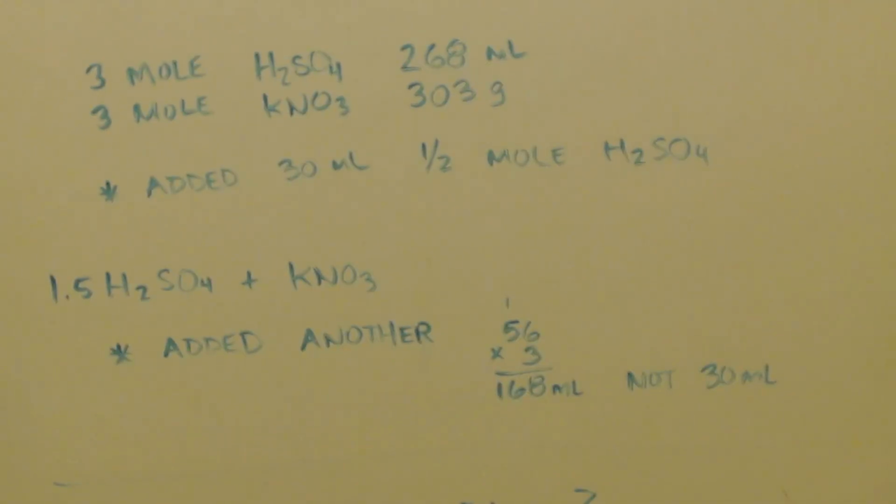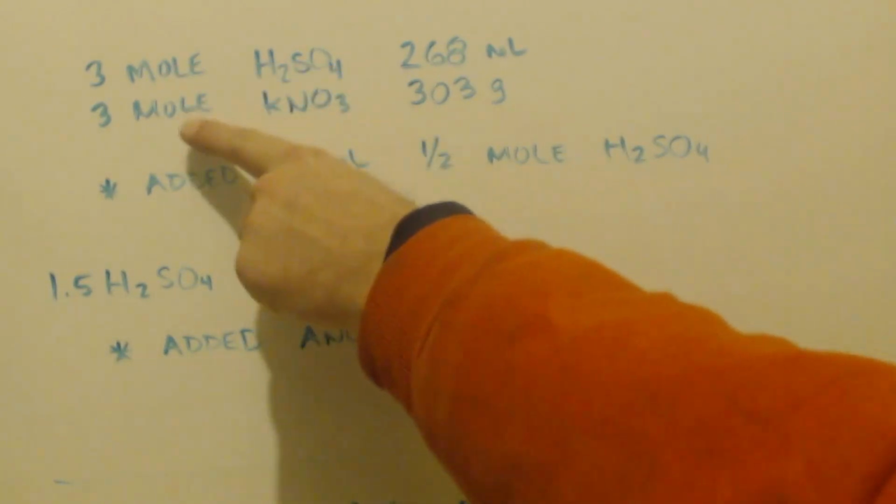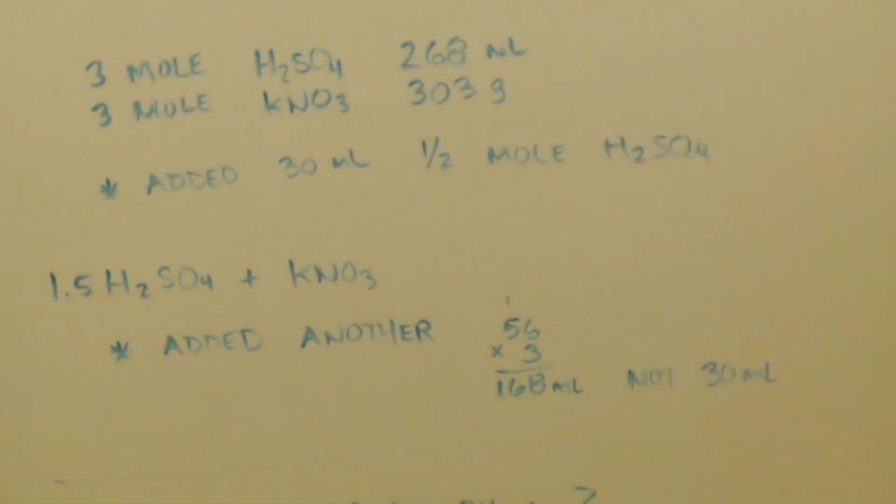Unfortunately, what I wanted to do was add 2 moles of sulfuric acid to 1 mole of potassium nitrate and see if I got 100%. You know what I mean? Unfortunately, what I did was I figured it out as 3 moles of that and 3 moles of that, which is a 1-to-1 ratio. That's what I was doing originally.